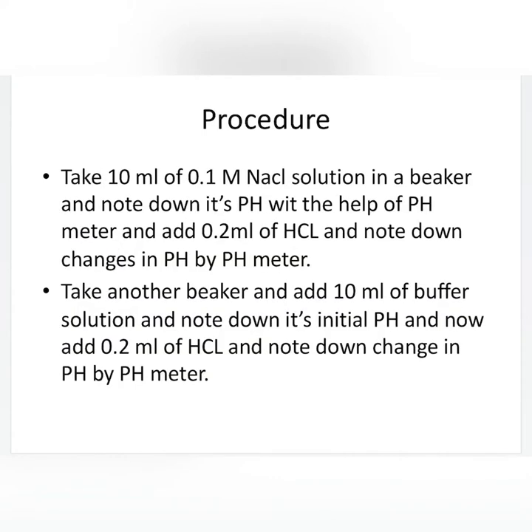First, we will take 10 ml of 0.1 M NaCl solution in a beaker and note down its initial pH with the help of a pH meter. Then we will add 0.2 ml of HCl and note down the change in pH. Then we will take another beaker, add 10 ml of buffer solution, note its initial pH, then add 0.2 ml of HCl and observe the change in pH.